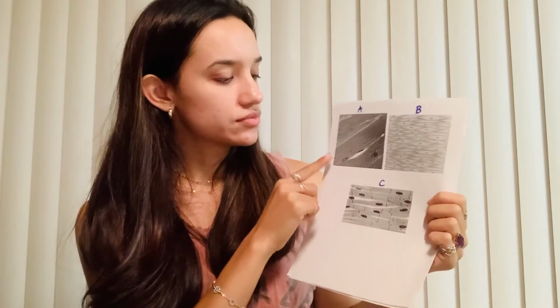I'm actually going to talk about muscle tissue now. In muscle tissue, we actually have skeletal muscle, and skeletal muscle has striations.